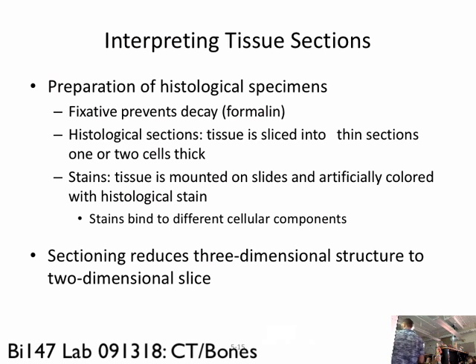So the sectioning is going to take three-dimensional structures, like maybe a tube that goes like this. There are tubes that go like that in your body. And if you're taking a slice through that tube, you're not going to see that tube doing all the stuff in 3D. You're going to see it like passing through the plane back and forth, right? So you have to somehow reconstruct that in your head a little bit, understand what you're looking at. And I'll give you an example.